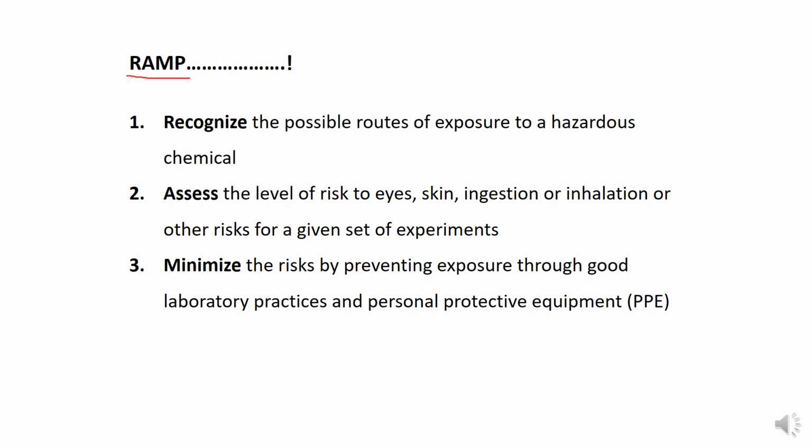You can remember this with RAMP, which is a combination of words. It stands for recognize, assess, and minimize. For example, recognize the possible routes of exposure to hazardous chemicals. If you're using some chemicals, you should recognize how this hazardous material can affect your body: through the mouth, through the skin by absorption, by injection, or how it can enter into your body.